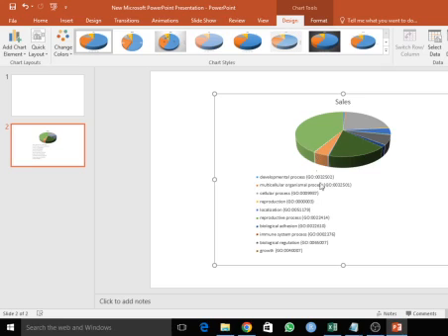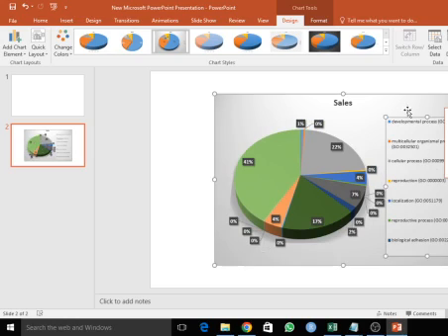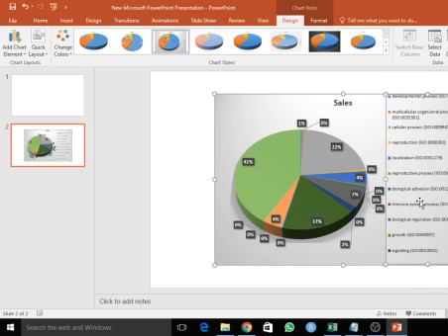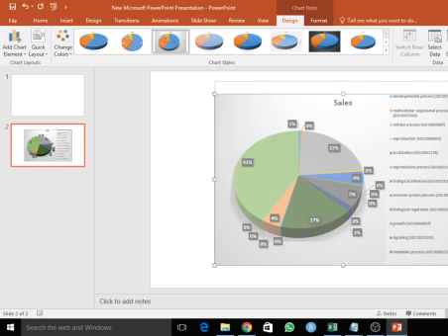Now to give a full explanation of our data, we must give it a better look, because it looks kind of awkward. First, we make it a best fit, and then make sure that all of the data can be expressed so the reader can understand it easily.